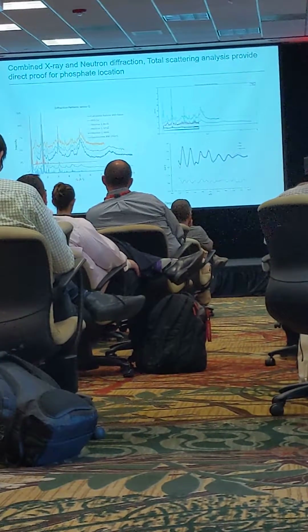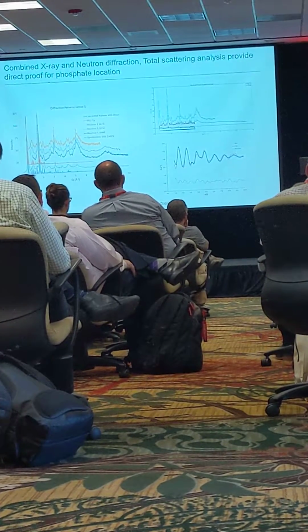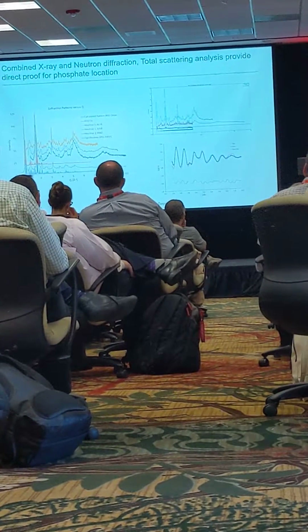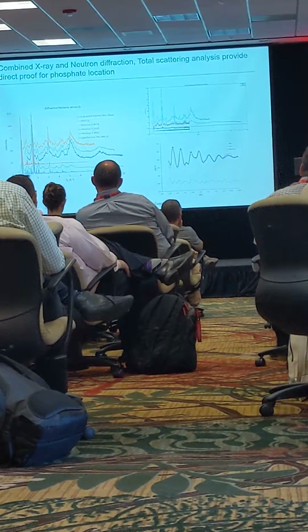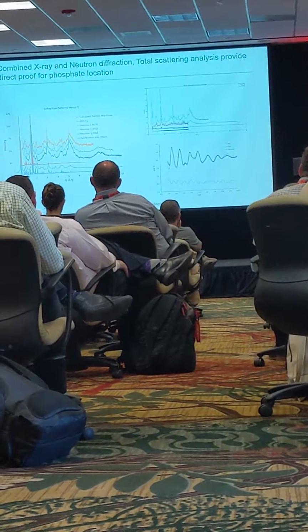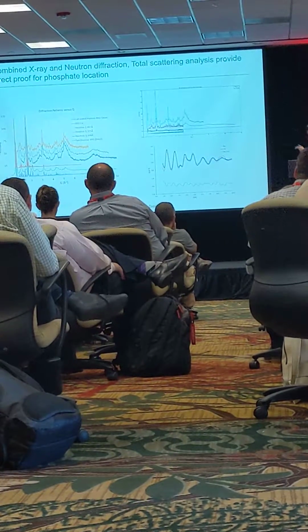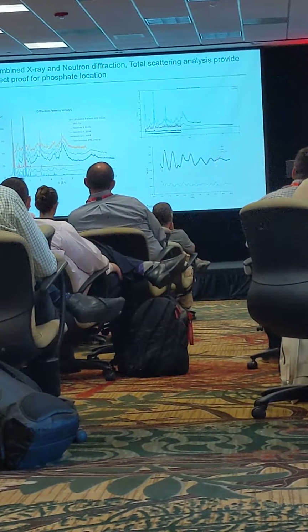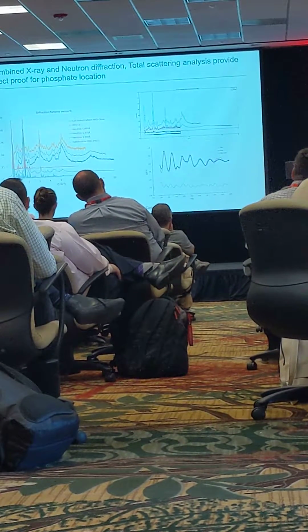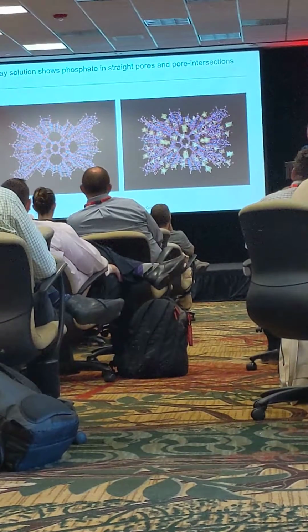We can start assembling a crystal and creating a theoretical PDF. If it matches the experimental one, great. We know exactly how the atoms are oriented. If it doesn't match, we change it, and we keep trying again until we get the crystal arrangement set up. And the team did that work. The experimental and calculated PDF are here, and they look pretty close. So let's see how this crystal is actually oriented and set up.